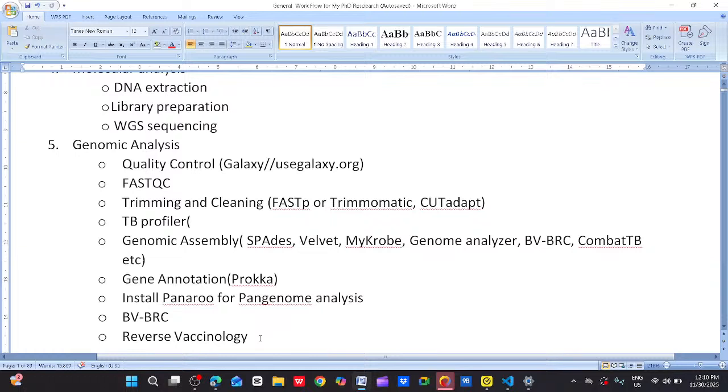And for some of us that will need to run other antimicrobial resistance databases like CARD, ResFinder, and some other databases, like the use of PATRIC, we will use PATRIC as well, so that we'll be able to do it once and at a time.